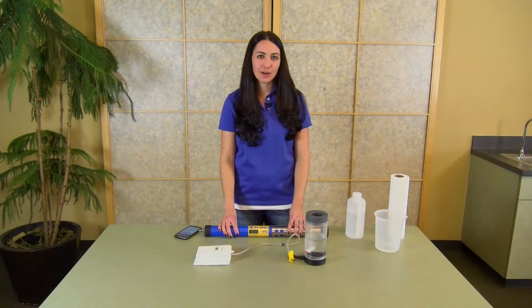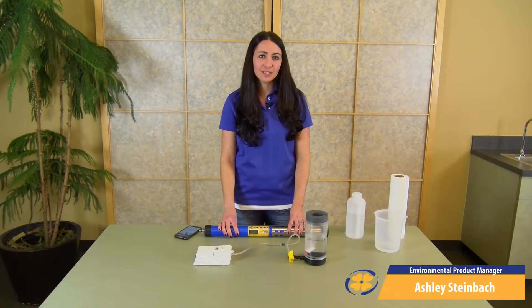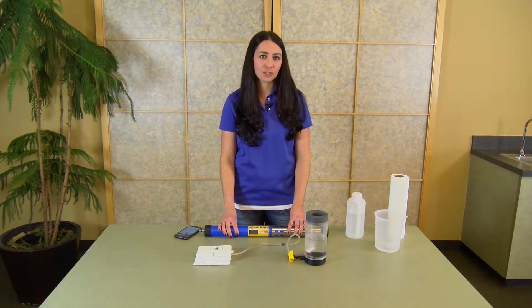Hi, I'm Ashley Steinbach, a product manager here at In-Situ. Today I want to talk about proper techniques for calibrating an RDO sensor on the AquaTroll 600.